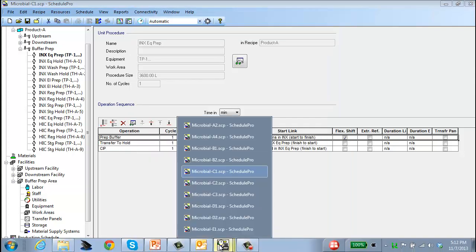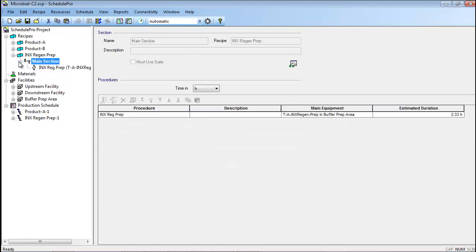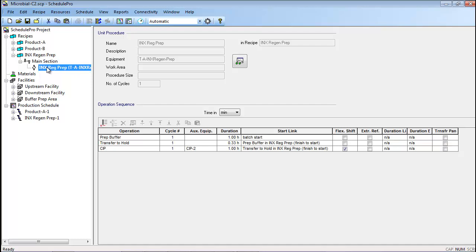This next case, C2, also uses buffer preparation and holding, but it represents a scenario where a single batch of ion exchange regeneration buffer is used for multiple production batches. The other buffers associated with Product A are all still prepared for single batch use. To model the preparation of a single batch of buffer that will be used in multiple production batches, a new INX regen prep recipe was created. This recipe is the same as the INX REG prep procedure which was included within the Product A recipe of the previous case. However, moving this procedure into its own recipe allows us to run fewer INX regen prep batches than Product A batches. In addition, it allows us to use the same batch of INX regen buffer for many different production recipes if desired.